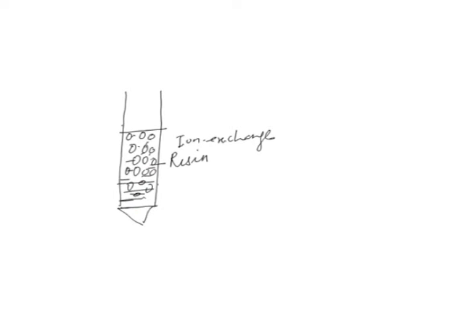Now, what you will do is, there are two ways, like through peristaltic pump, as we were discussing in earlier lectures. You can do it by peristaltic pump, or you can manually load the sample with a micro pipette.